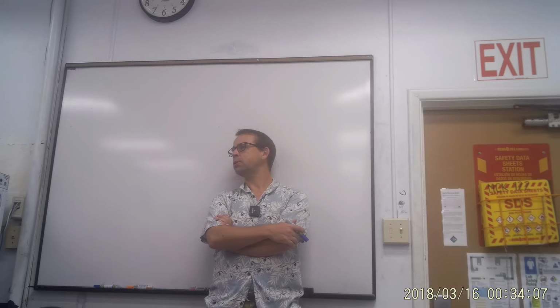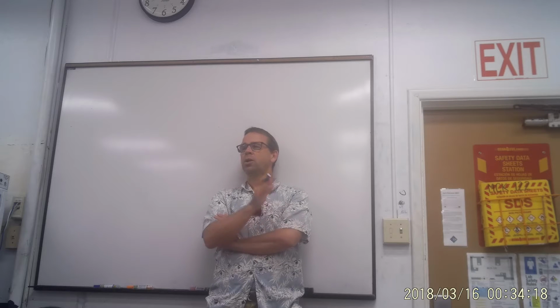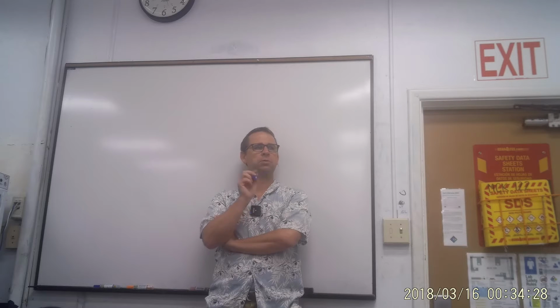Lab 2. What did we do in lab 2 that you think you might need to be able to do well moving forward in your life? Preparing solutions. That's right. And you will need to prepare a solution. So we don't have time to do everything in all of the labs in this small 2-hour, or hopefully 1 to 1.5 hour block.